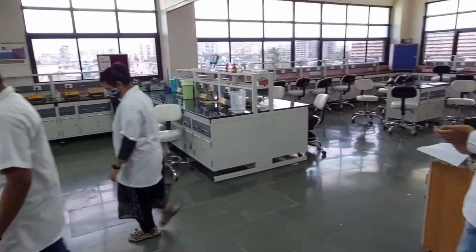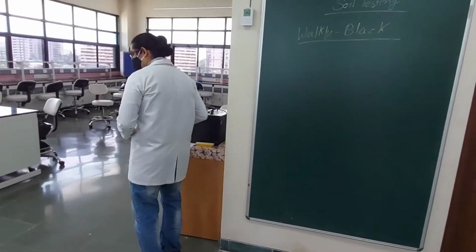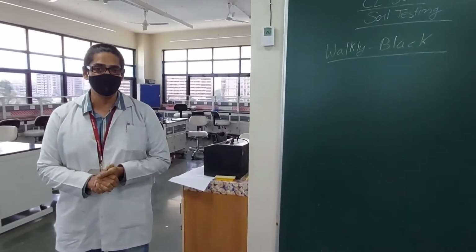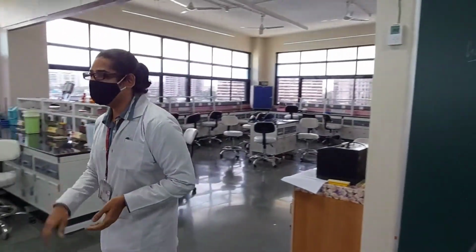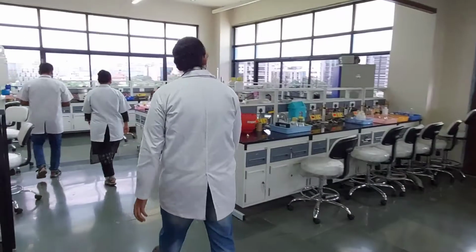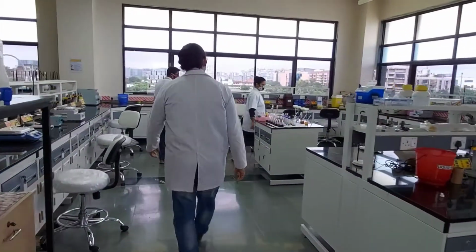Now, what we are going to measure first is the pH of the soil. We start off with the pH. But to measure the pH, we have to process the soil. Now, what kind of samples do we have? So, can you show us the samples?